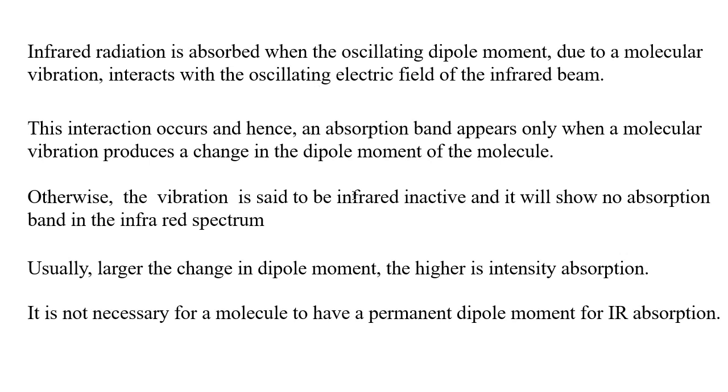That is, an absorption band appears only when a molecular vibration produces a change in the dipole moment of the molecule. Otherwise the vibration is said to be infrared inactive, and will show no absorption band in the infrared spectrum.